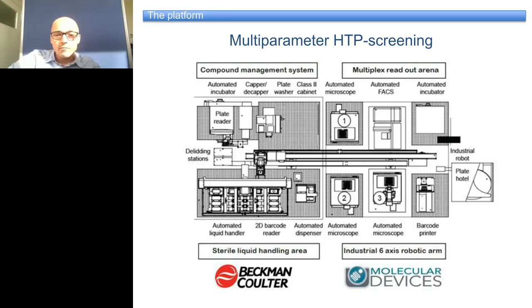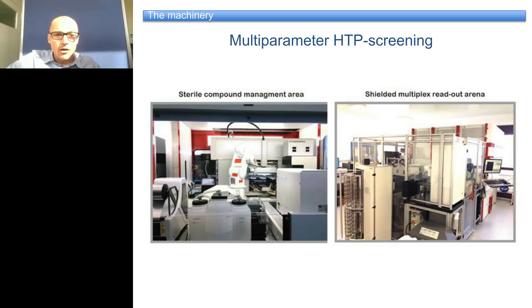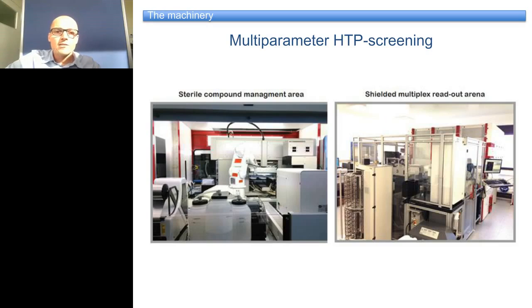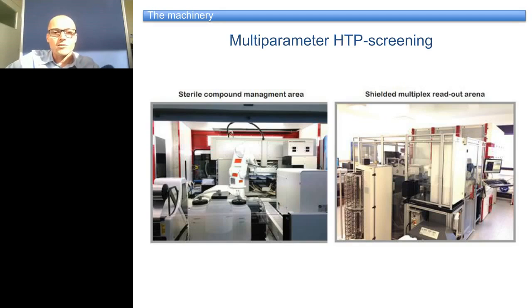The machinery looks like this: we have the sterile compound management and liquid handling area on one side, entirely shielded. You can see the Motoman robot interacting with the Biomac FXP on that side. On the other side, the platform is physically divided — you have the shielded multiplex readout arena. This shield surrounds everything because the Motoman robot moves very fast, so we have to protect scientists working on that platform.